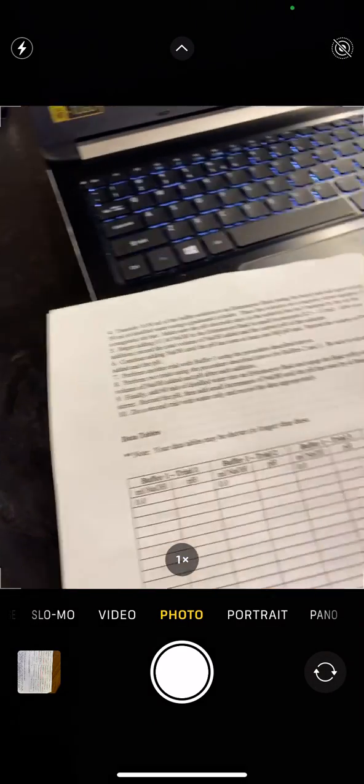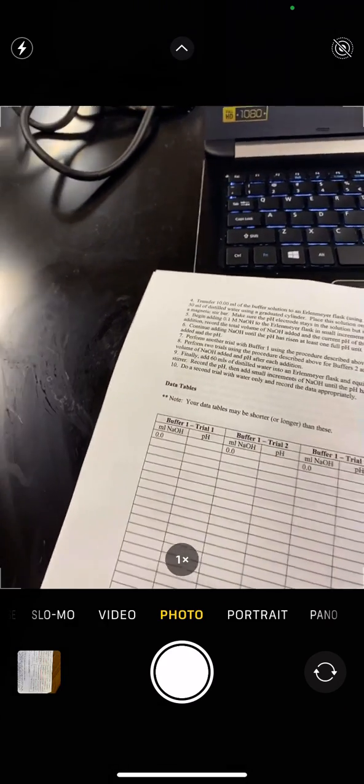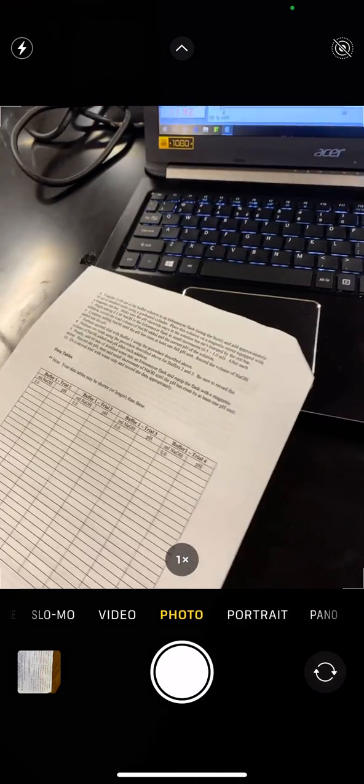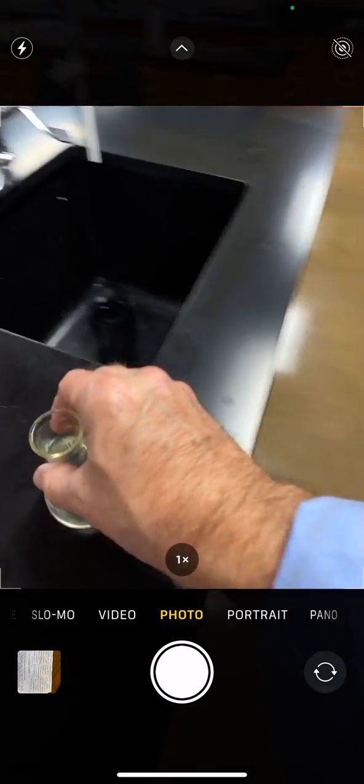So the pH started out at 5. It has now jumped past 6. So we were just going up past 6. So we're done. So this last one we added 3 times and we got 11.41. So total, you want to add up the total milliliters down here at the bottom. Okay. So for that particular buffer, it took 3. I'm going to set this aside.